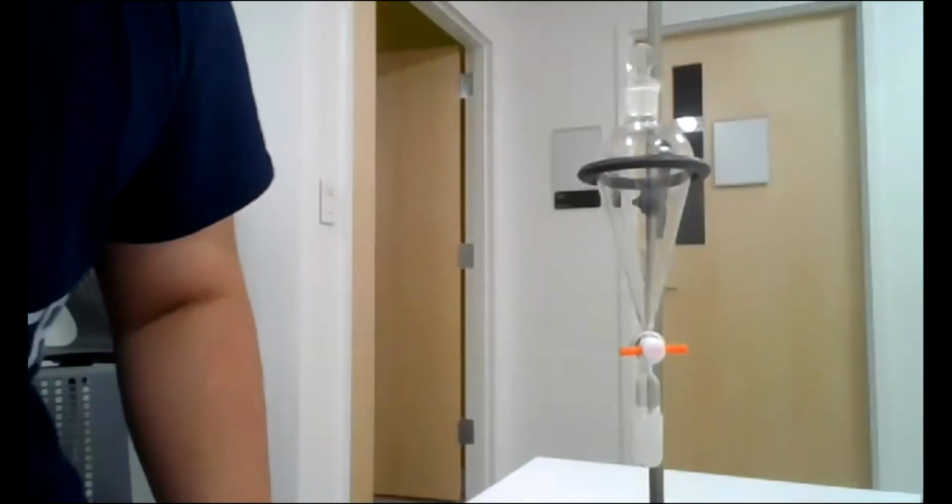There's a modification to the procedure. I don't want to keep jumping back and forth between the worksheet and the video, but the modification is we are using only 20 milliliters of the iodine aqueous solution and only 20 milliliters of the cyclohexane organic solvent.